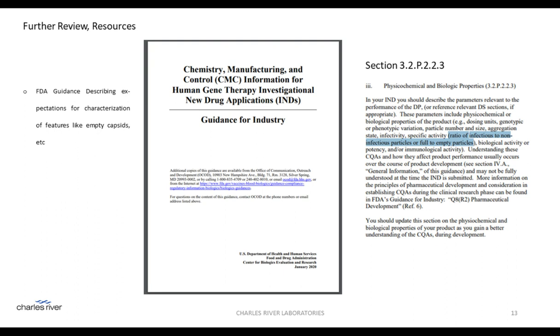This reference will certainly be of value to anyone interested in regulatory guidance. This FDA publication is from January of this year and is the latest guidance on CMC best practices, and in particular, section 3.2.P.2.2.3, as is excerpted here on the right-hand side, and the references and the discussion in particular within that section is important and gives the reader a sense of how empty levels should be defined and approached.